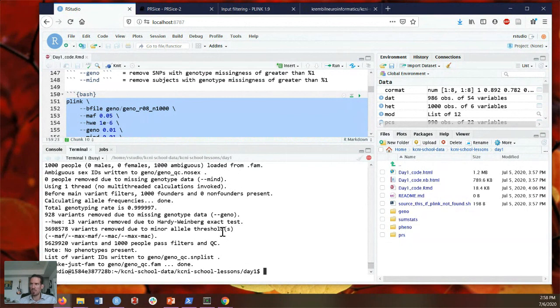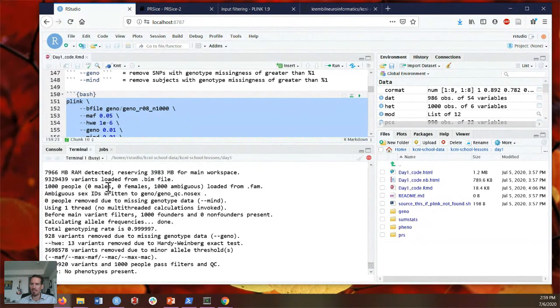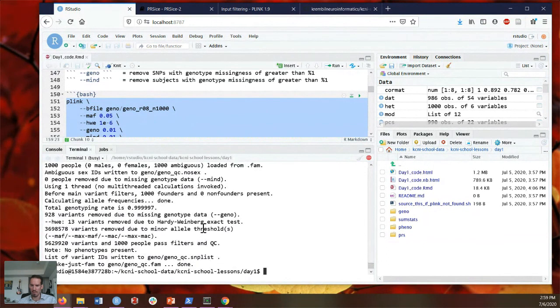Daniel, is this for settings resources inside of RStudio for allocating more memory? Right, so this is the thing that I'm concerned about. Typically it should be able to recognize it. Everything that I've run on here is through default settings, but it's only detected 8,000 megabytes of RAM. I have quite a bit more than that.